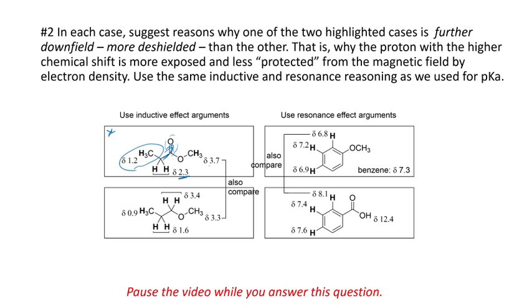And then finally, we have this CH3 at 3.7. That's because it's attached to the oxygen. The oxygen is inductively pulling electrons away from the CH3. And besides that, it's got this extra carbonyl group that it's pulling electrons very strongly away from that CH3.